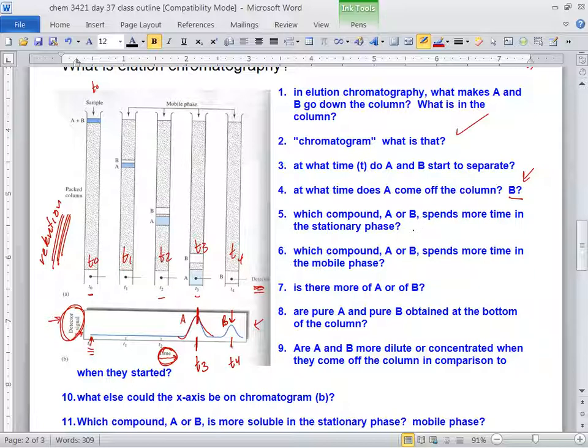Good question. You change the sample. No longer is it leaf extract. It's leaf extract mixed in with someone's mess of whether beer or wine, whatever. No, it doesn't matter. Cocaine or whatever the analyte will be will always have that same retention time because it's the analyte that matters, not the original mixture. So that's the real power in this chromatography.